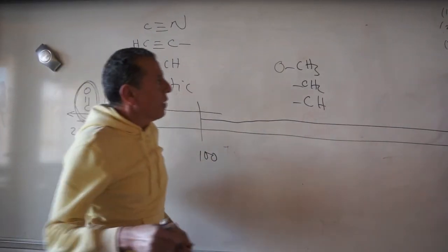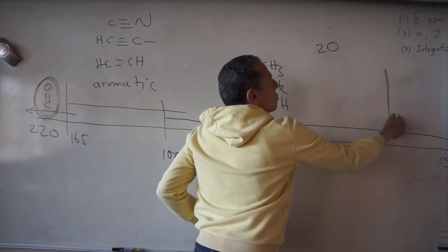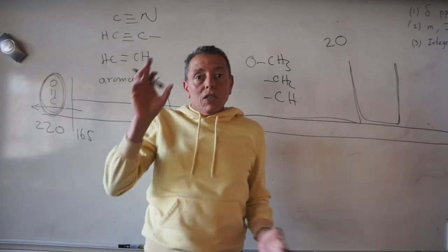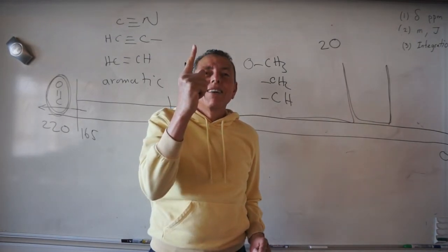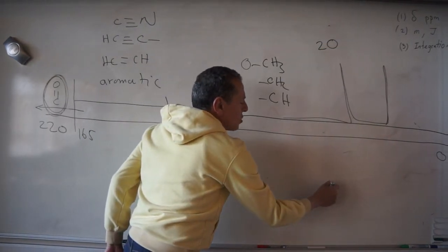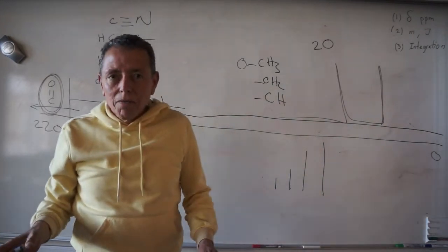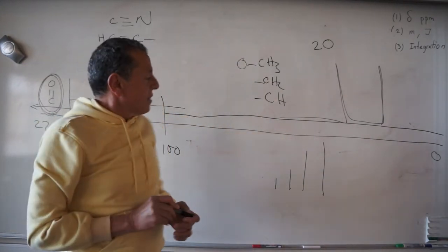Of course, remember, if the molecule contains 20 carbons, it means that you will see 20 lines, 20 peaks, right? Unless, of course, two carbons are similar, following the same rules as the proton. Similar carbon atoms, magnetically and chemically equivalent, give only one peak, right? Usually also in the intensity, you will see that CH3 has higher intensity than CH2, than CH, than the quaternary carbon. When there is more hydrogen, of course, the intensity is more. So this is the carbon 13.